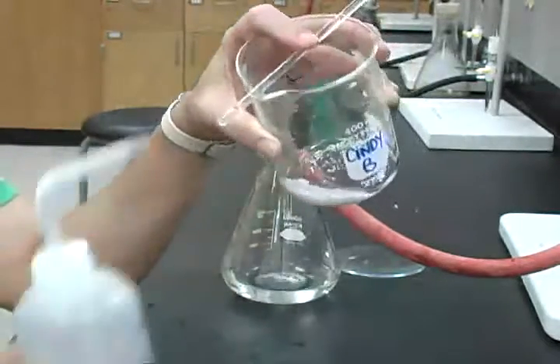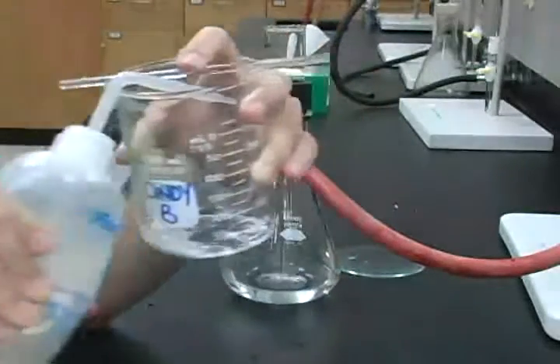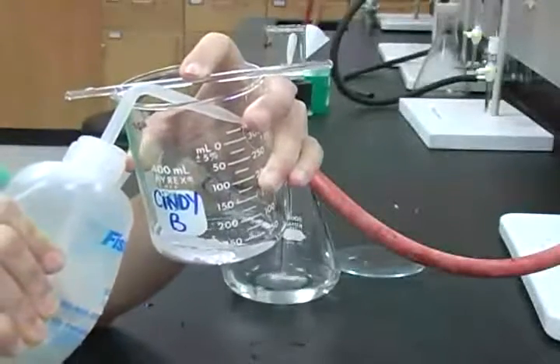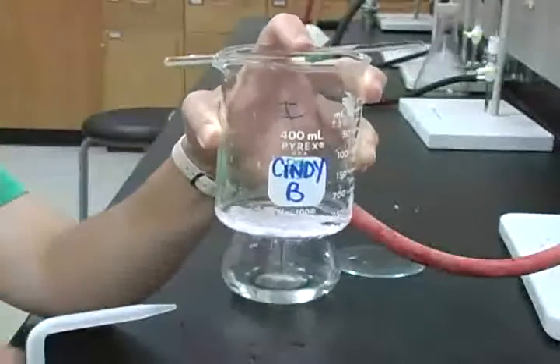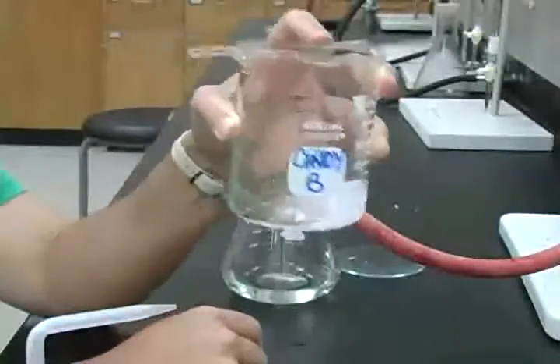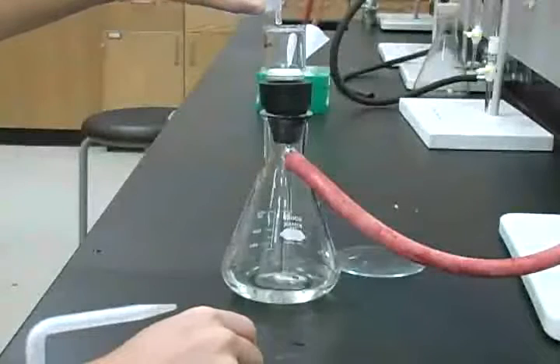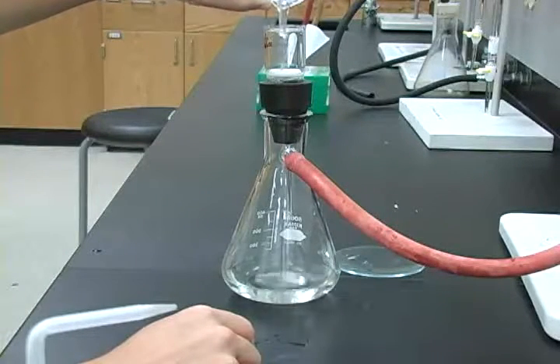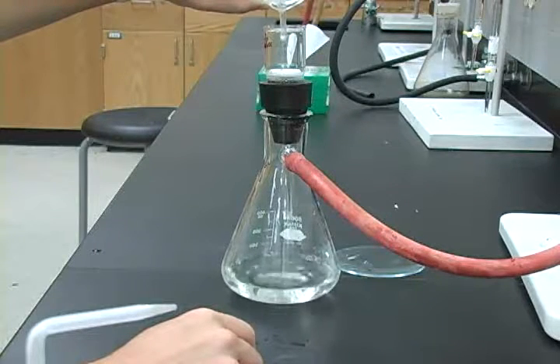To wash the precipitate, you're going to squirt wash solution down the walls of the beaker, not squirting directly on the surface of the solid. Physical forces such as that can also cause peptization. Once the precipitate is coated with wash solution, gently agitate the mixture and then filter those washings, decant those washings. You want to repeat that washing process at least 3 to 4 times.